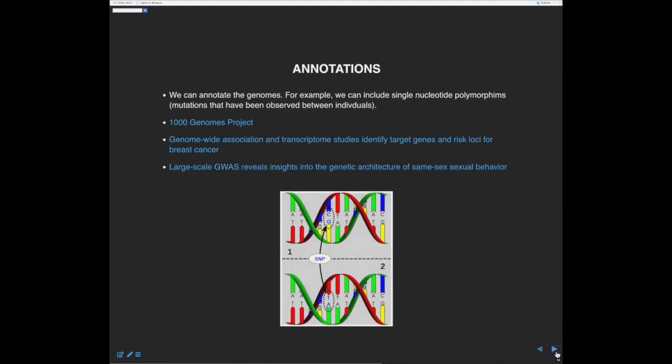Okay, so that's basically Biostrings, a way of representing biological strings, and BSgenomes is one way to bring genomes quickly into R. But even once you have the genomes represented as Biostrings in R, there's still the need to annotate those genomes, right? They're not really very useful if it's just a long nucleic acid sequence. Really what you want to do is know where the genes are, where the exons are, the introns, the UTRs. You want to know where the binding sites are in promoters, where enhancers are, retrotransposons, all these kinds of objects you would like to know.